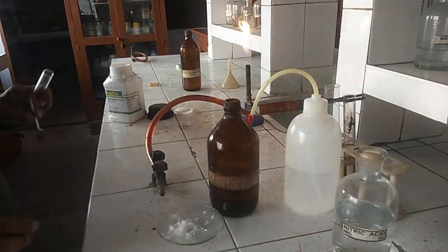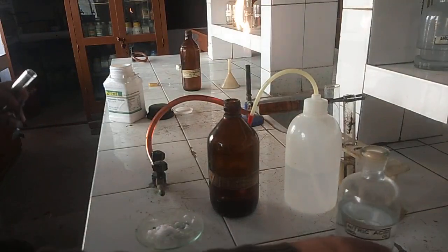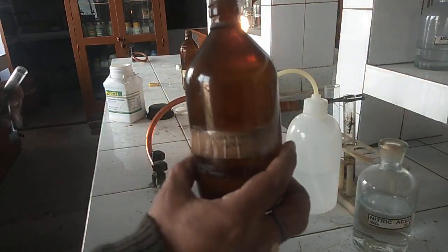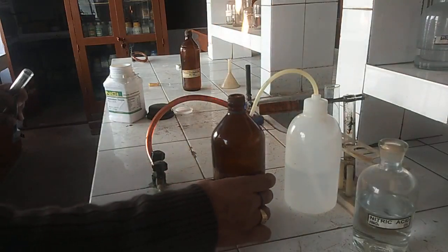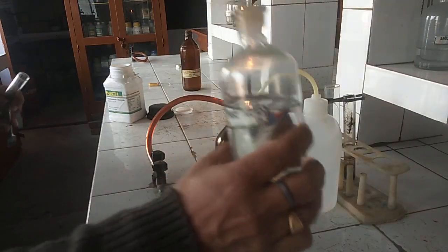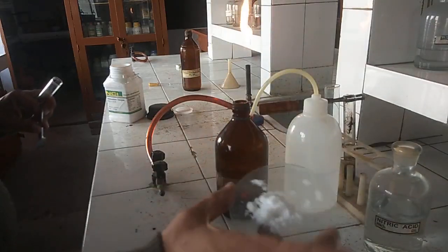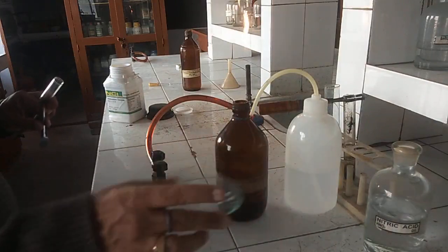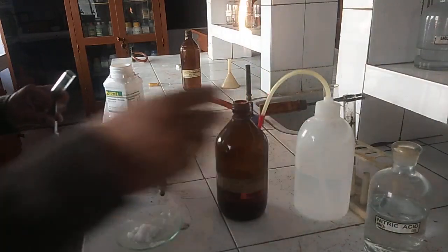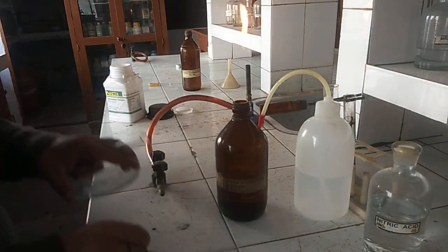Another confirmatory test for chloride ion is done through silver nitrate solution. For this we require AgNO3, dilute HNO3, salt, and distilled water. The process is the same. We will take some salt in a clean dry test tube.